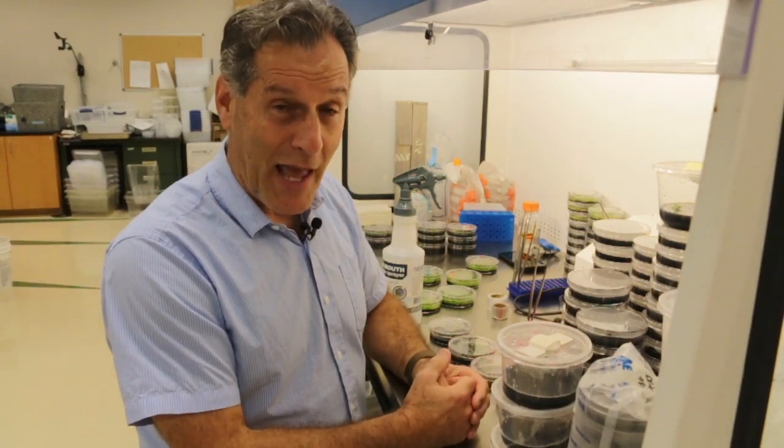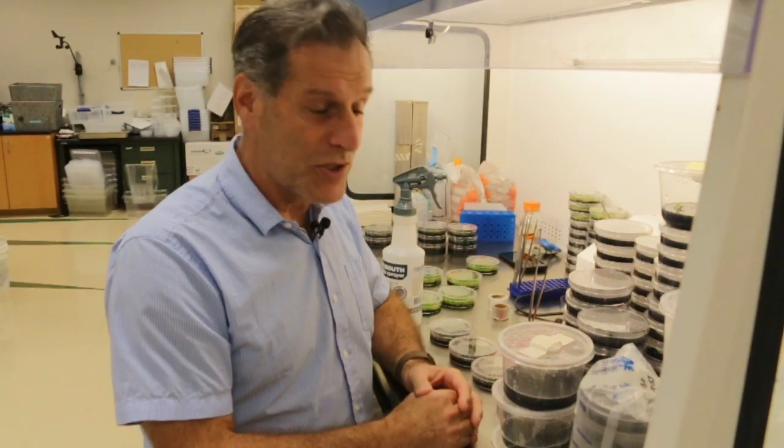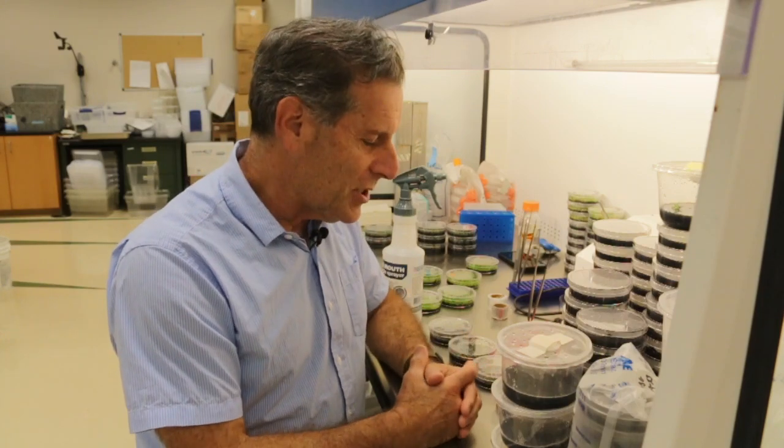I obtained some in my former university laboratory and just kept them growing with subculture for years and years. They're just fun and easy to grow.